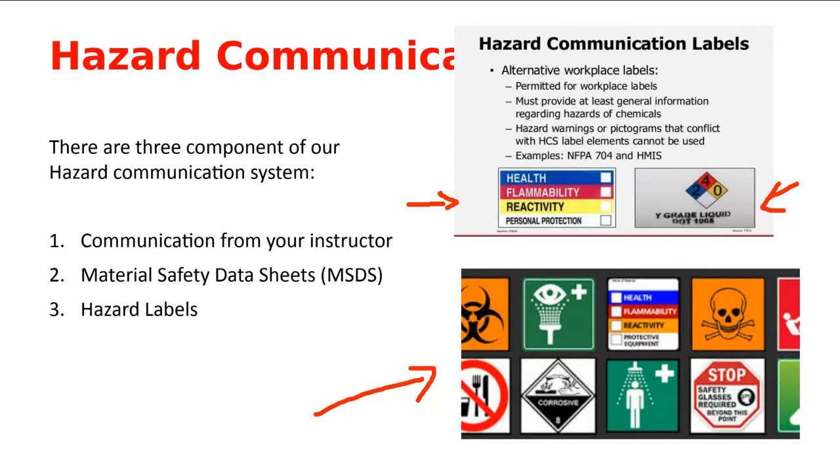Okay, there's a lot of them, and I'm not going to expect you to know all of them, but I'll show you which ones I want you to know. Anybody have any questions so far? Be sure you know what a hazardous communication program is and the three elements.